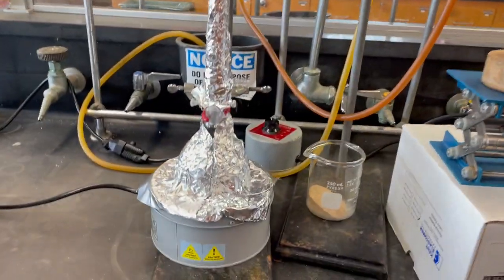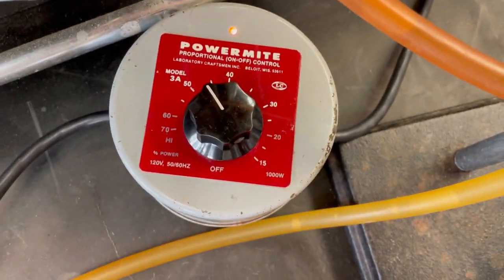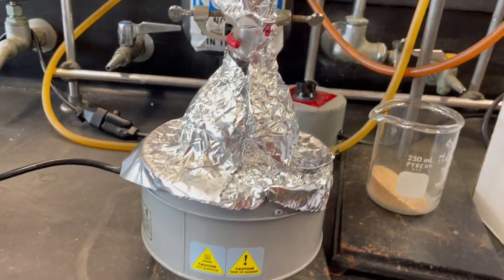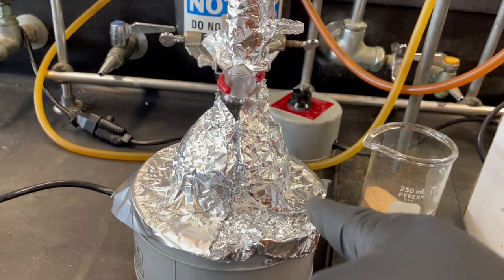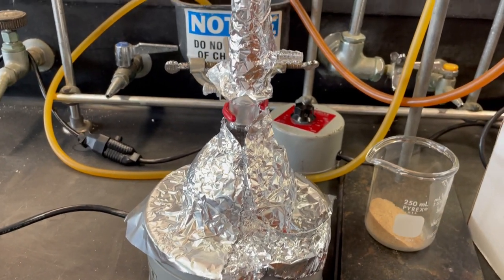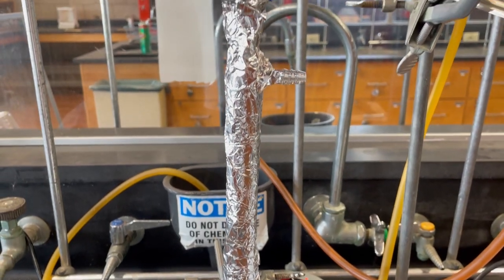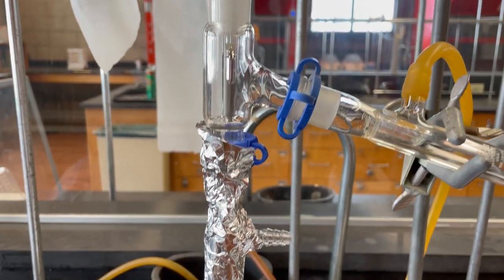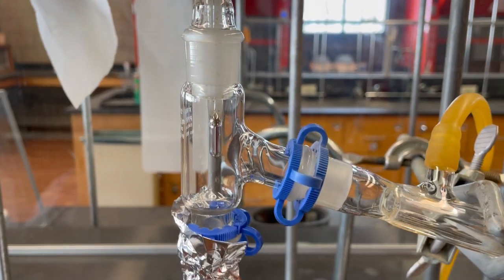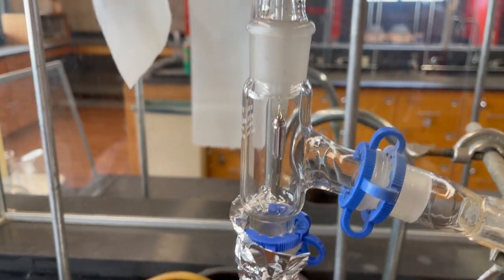All right, so I got that heat going. Turn that up to 11 or like 47. So I put some foil around there, so any heat that would have been lost out the sides or whatever is going to be right on that round bottom. Heat that bad boy up. Keep that column nice and hot too with the foil wrapped around it. You could use other things, depends on your setup, but foil is what we got, so that's what we're using. And then time for a snack, because it's about to be a minute.